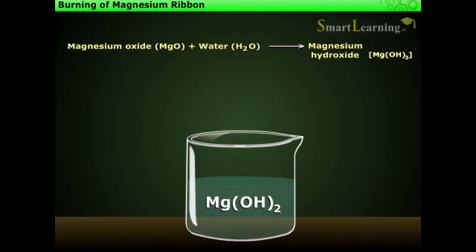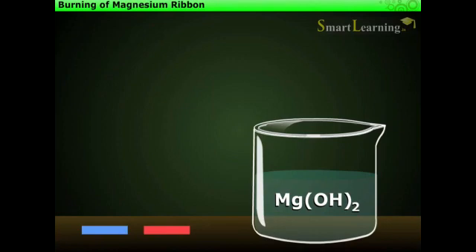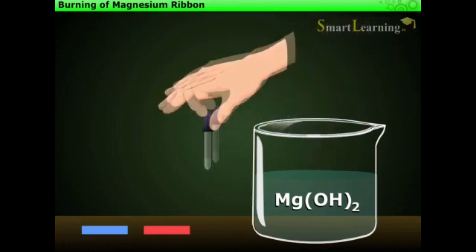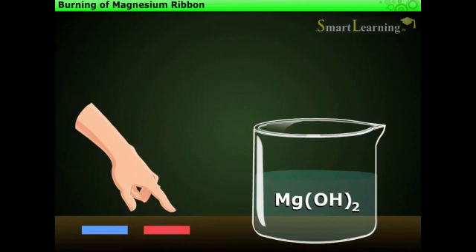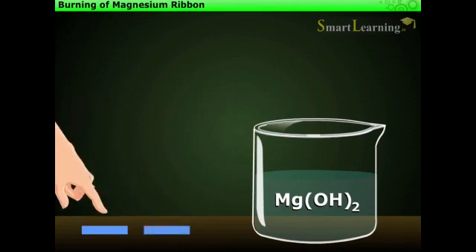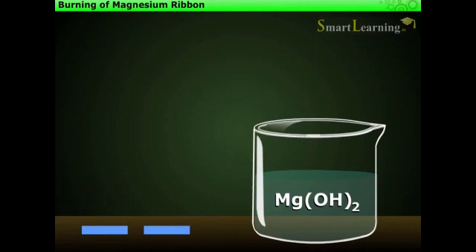To test the basic nature of the solution, that is magnesium hydroxide, let us perform an indicator test. Take red and blue litmus paper. Add two to three drops of aqueous solution on both papers. We observe that the red litmus paper turns blue, whereas there is no change on blue litmus paper. This proves that aqueous solution of magnesium hydroxide is basic in nature as it turns red litmus paper blue.